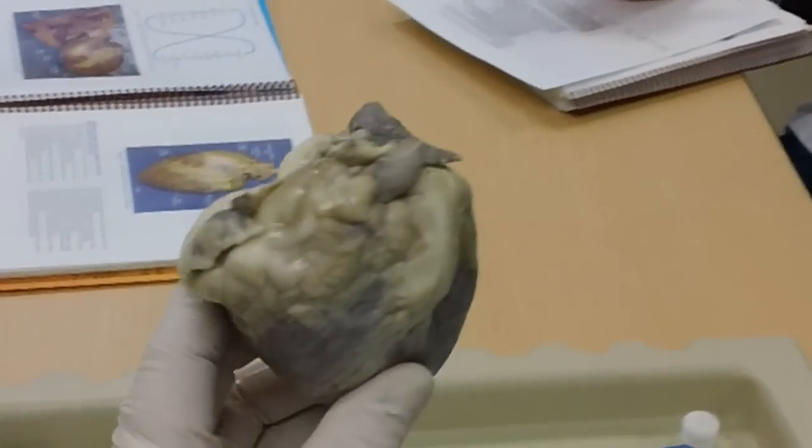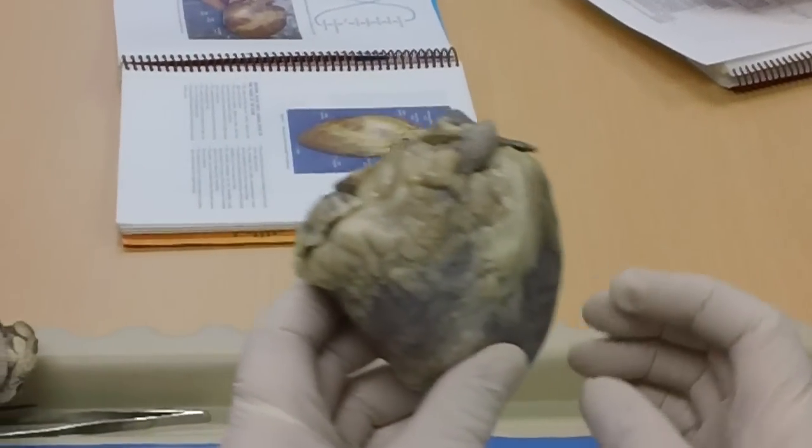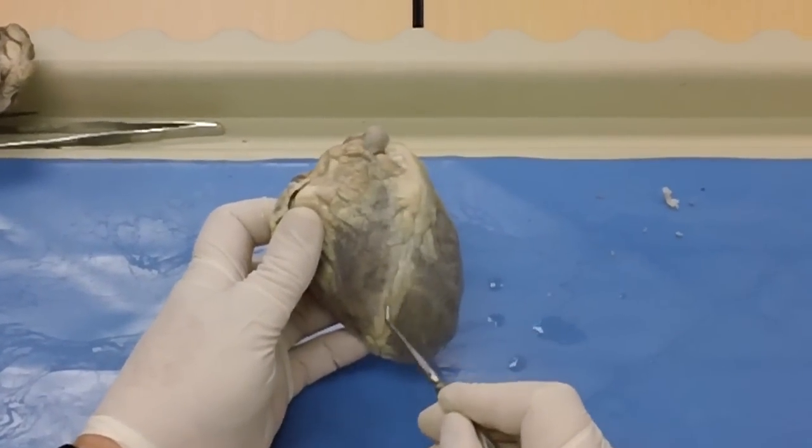This is really important to understand: how to orient it so you know which side is which. The head of this animal is right here. Now that I've got that figured out, I can figure out what this structure is.